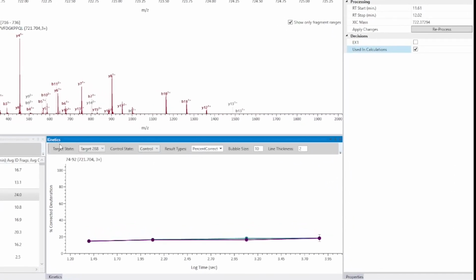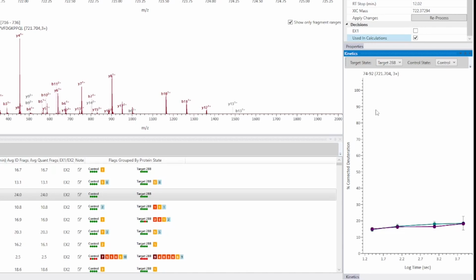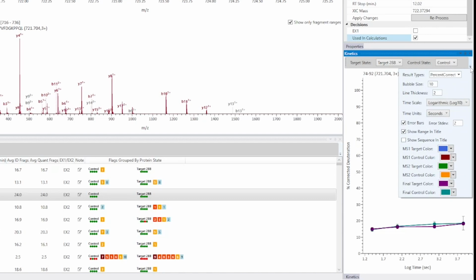And if you don't see all of the options in the toolbar at the top here, for example, when this view is initially docked on the right hand side, you can see it's pretty narrow. If you don't see all of the options on the toolbar, there is this black arrow that is available on all the toolbars that expands the remaining options. And so there are a couple of settings that you can set for this view.